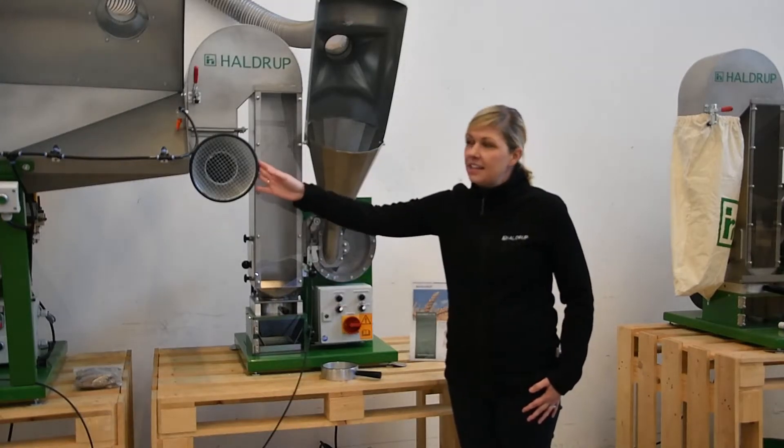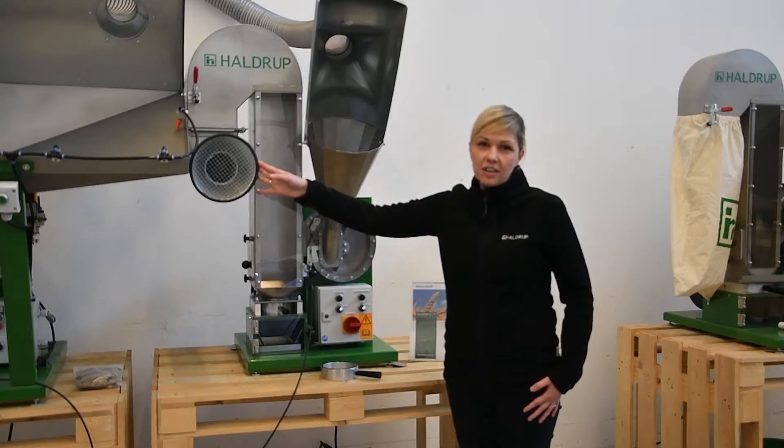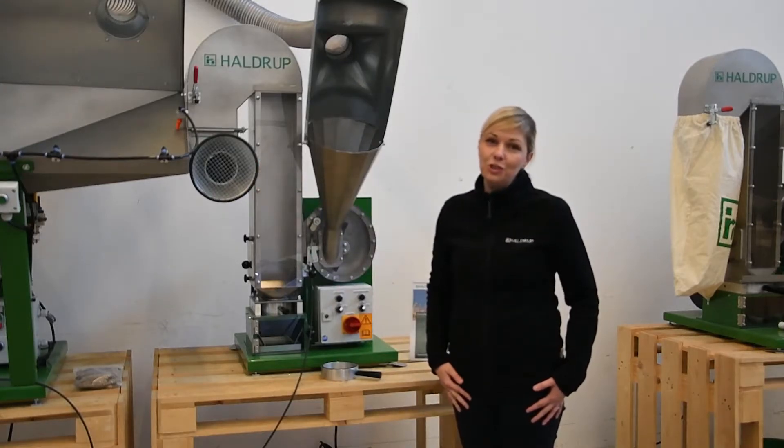This machine can also be attached to the dust extractor, and now we will show you how it works in action.